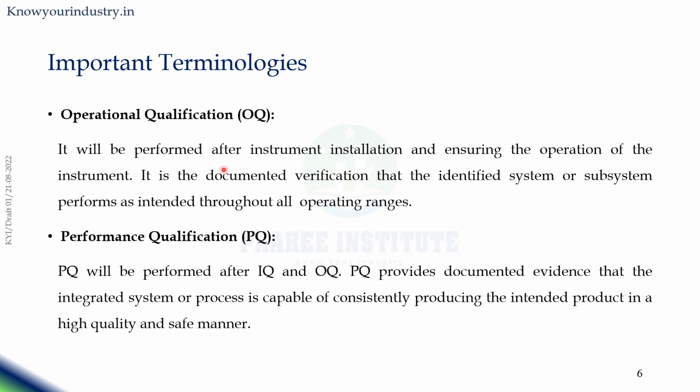It will be performed after the instrument is installed in the analytical laboratory to ensure the operation of the instrument. It is documented verification that the identified system or subsystem performs as intended throughout all operating ranges. So these operating ranges will have different parameters.